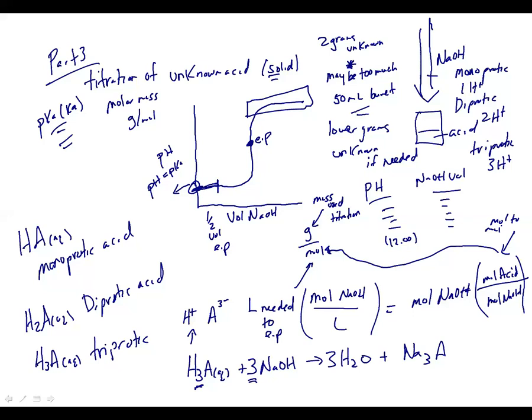So in each of these parts, you should be able to use the simulation software. Again, you probably have to click the link and go out of Canvas to do that. It won't load in Canvas, so a reminder that you'll have to do that. And just like with the buffer one, or the pH and hydrolysis one, grab the stuff, add it, do the titration, and record that stuff. So I believe up there right now, what you'll see is the instructions for each of the parts. You'll see notebook pages that you could use as a template in Word to do your notebook pages and keep track of everything that you need to.